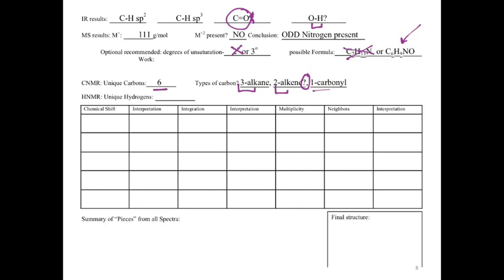So what we're going to try and do is convert everything within our spectra into this table. So we're looking at the chemical shift, the integration, and the multiplicity. We're going to evaluate each of those independently and slowly add the information in. Once all of our information is in the table, then we'll go through and actually start to interpret it.